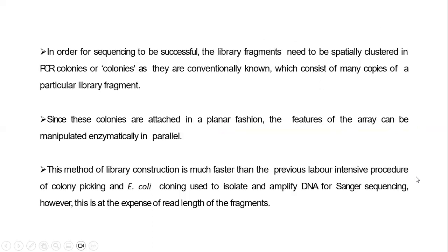Now, in order for the sequencing reaction to be successful, the library fragments need to be spatially clustered in the PCR colonies, as they are conventionally known, which consist of many copies of a particular library fragment. Since these colonies are attached in a planar fashion, the feature of an array can be manipulated enzymatically in parallel.